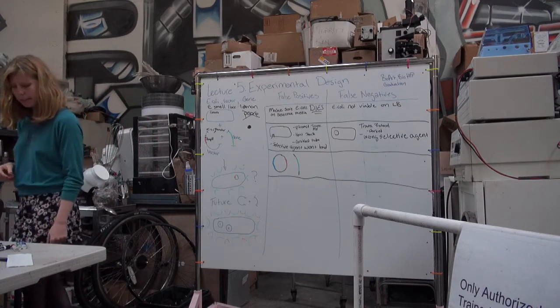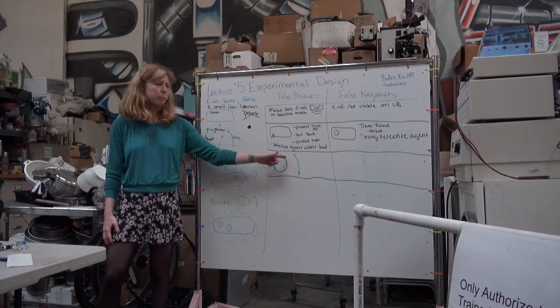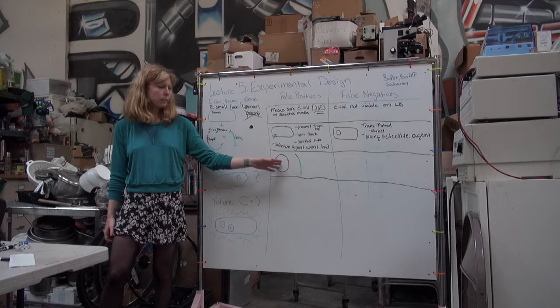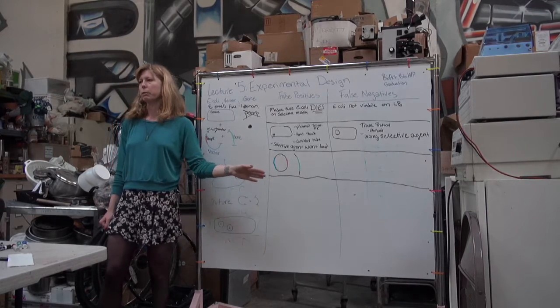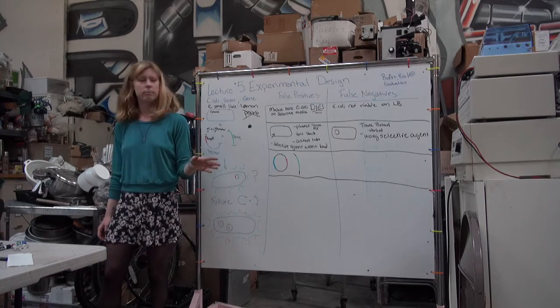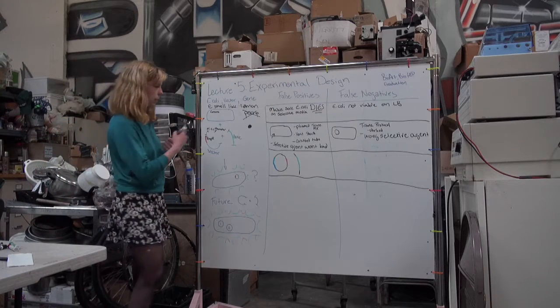Lots of big words, but basically, if this plasmid was put on a plate with a special agent called X-gal, the E. coli that had this plasmid would turn blue. Okay, the E. coli that didn't have this plasmid would stay white. That's really very common.